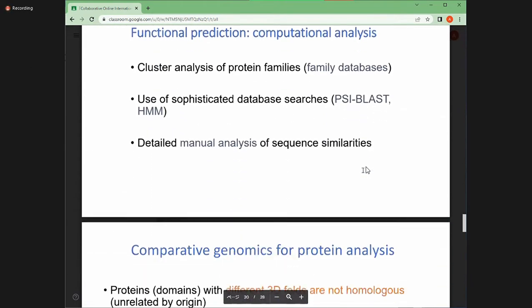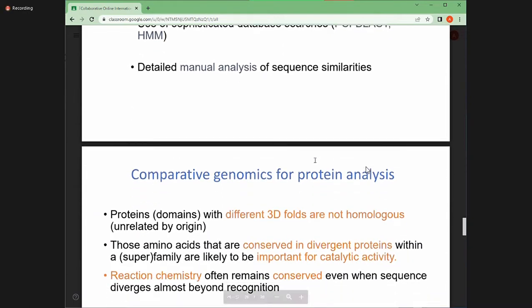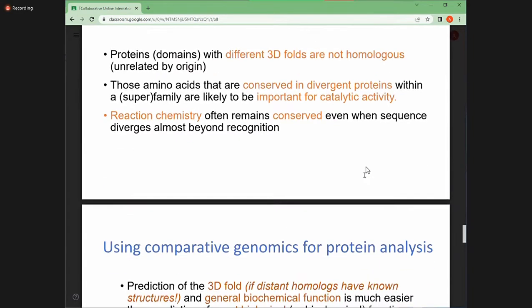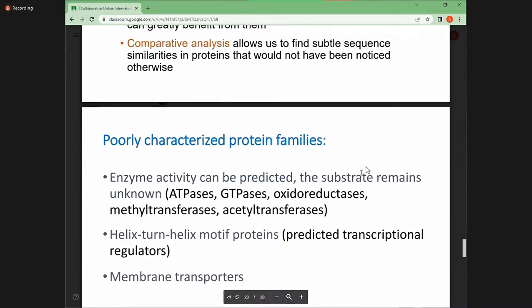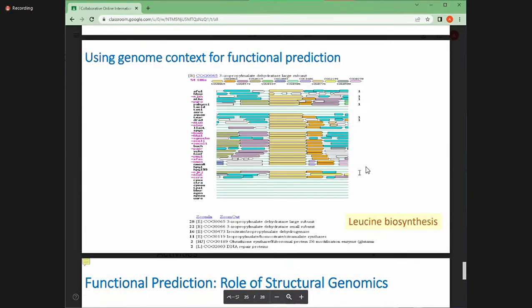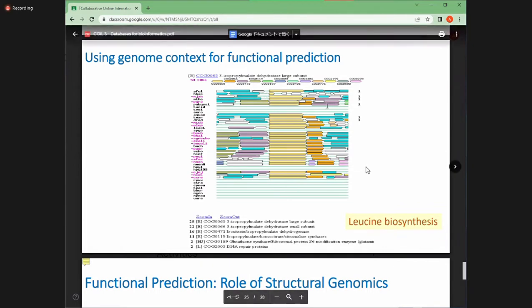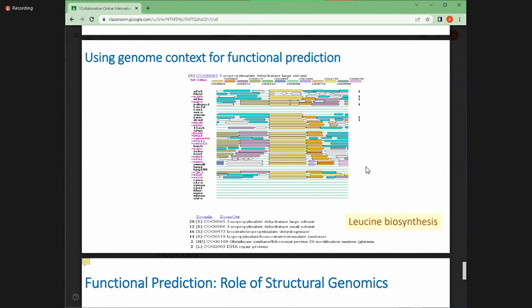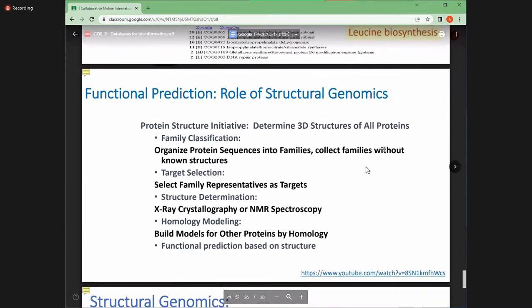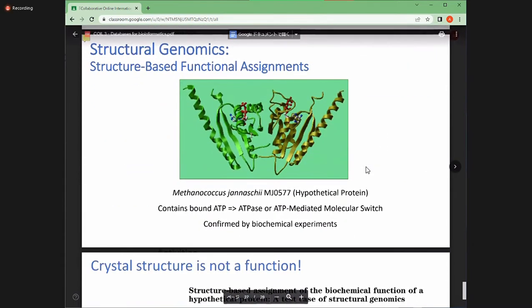And let's just skip through this because I will explain as we go through together with some class activity, and then we will see how to use different types of tools. All right. So this is an example of how when you annotate genes, you have blocks where the database will identify the genes. You can see the yellow part over here, those are conserved with different types of organisms here. But don't worry, we will just look at this, and then the structural as well.